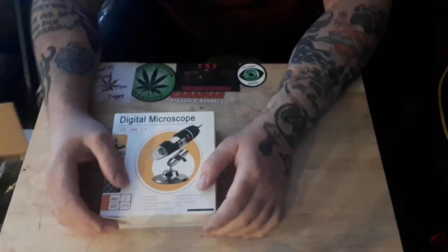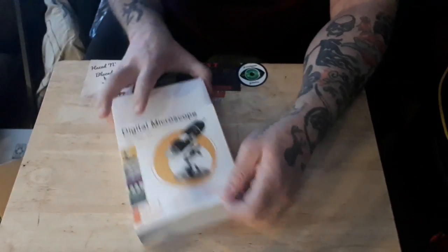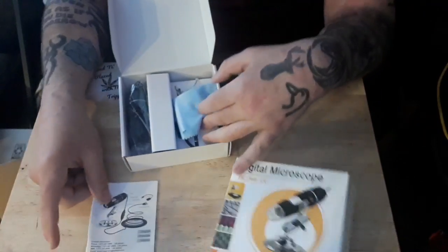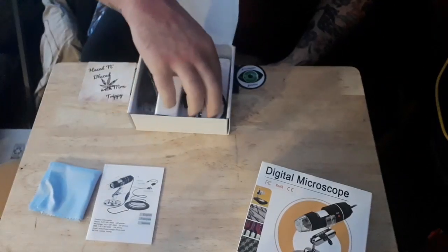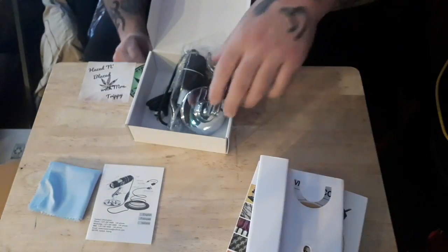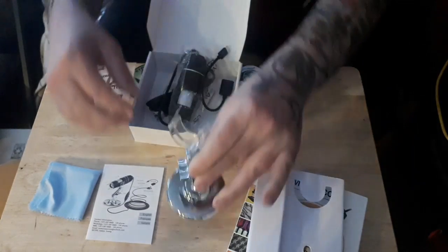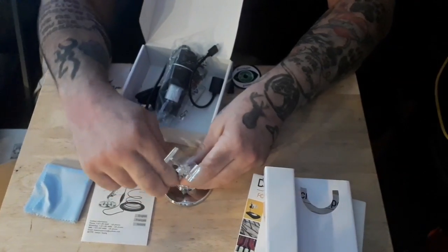So that is a digital microscope. I guess we're going to open it up and see what's in the box. You got your instructions, you got your little clean thingy-mabobber, a little piece of cardboard — and hey, it comes with a stand. I didn't even realize that. So it comes with a stand and your microscope, and you can adjust it any which way you want.